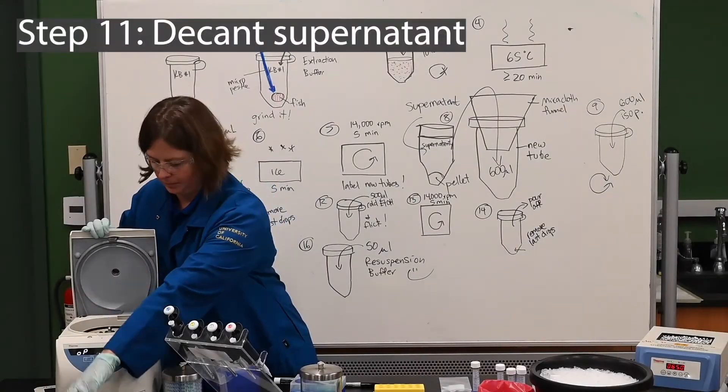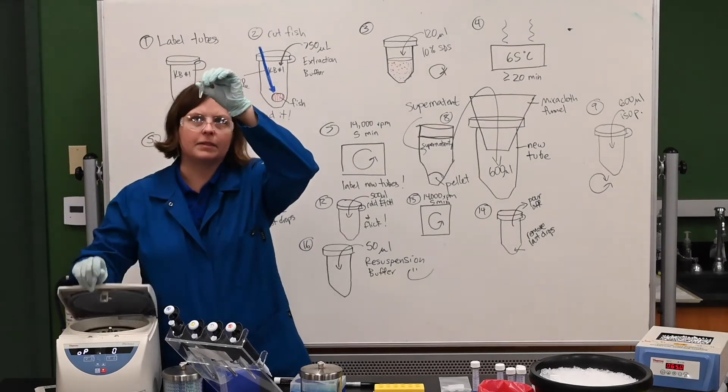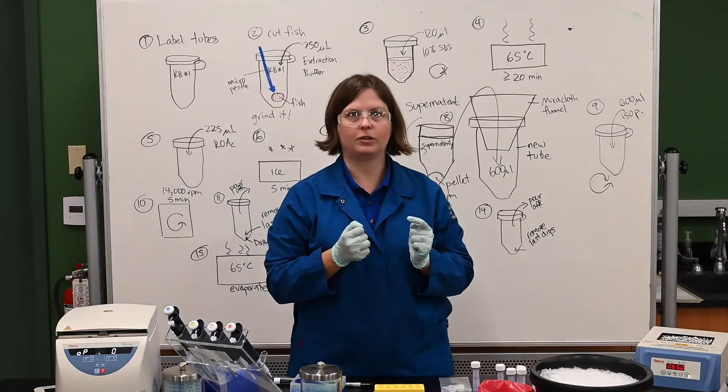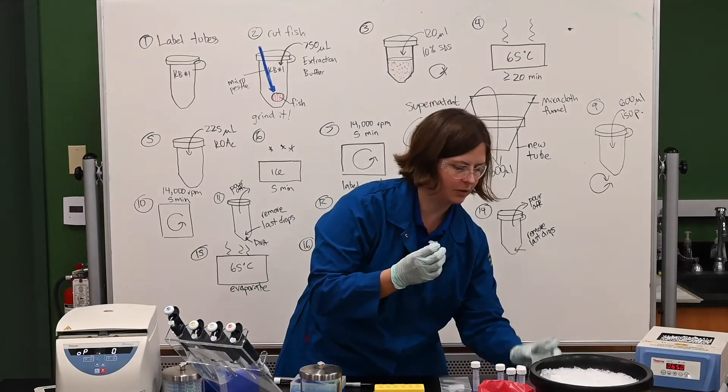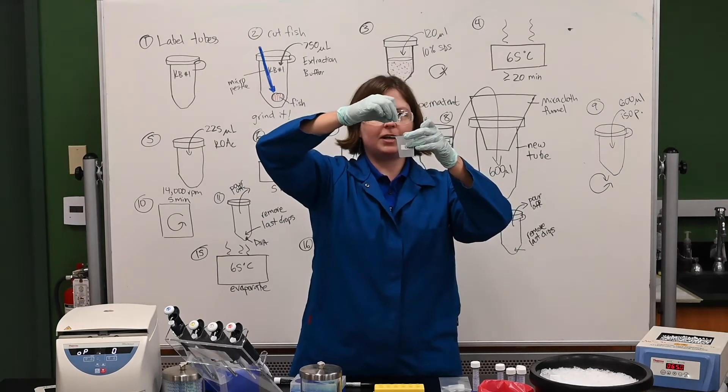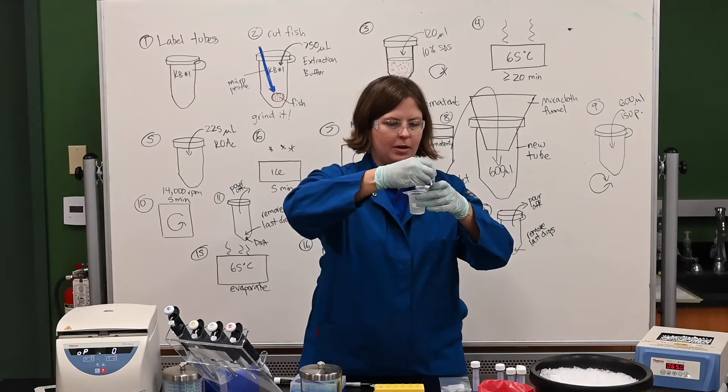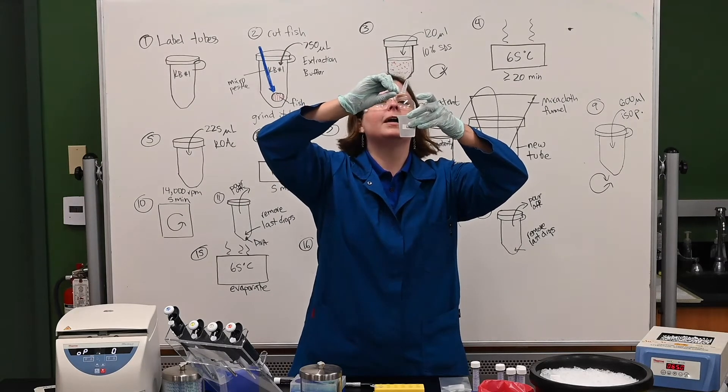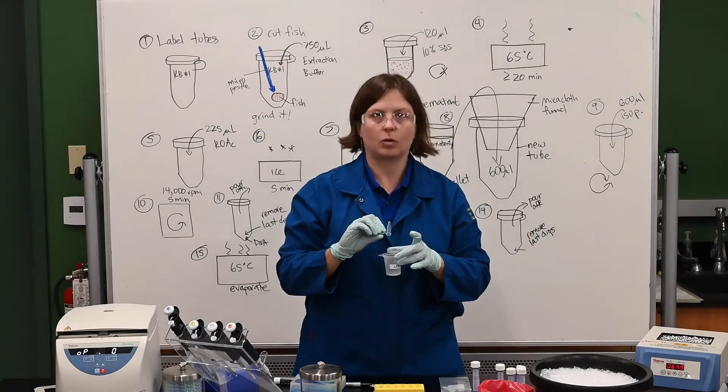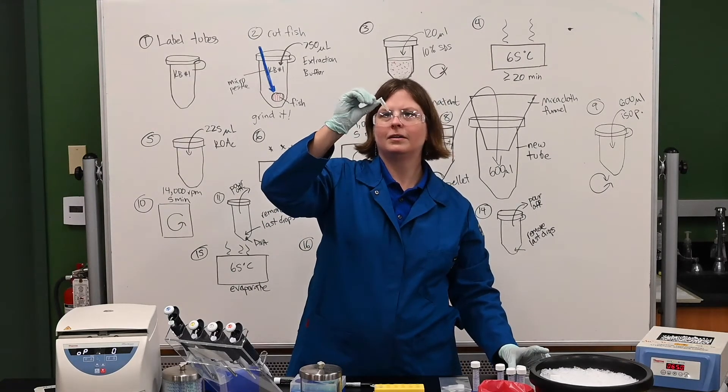You have to pour off the liquid and assume that there is a tiny pellet of DNA in that tube. I can't even, I can't see anything from here. It looks totally clear. I'm just going to go on the trust that I've done this before and there's still DNA in this tube. So I'm going to dump the liquid out. I know it's like, all that work, are you sure you did it right? I'm just going to assume I did it right. I'm assuming there's DNA in this tube. It's very small. This one too. And again, students always find this scary because they're like, but what if I did it wrong and my DNA just got dumped into my waste jar? We've never had it happen. It's okay. So there's still DNA in there. We just can't see it. That tube looks empty.